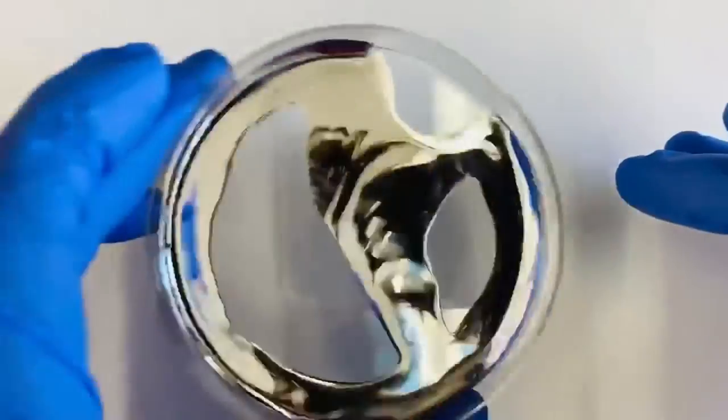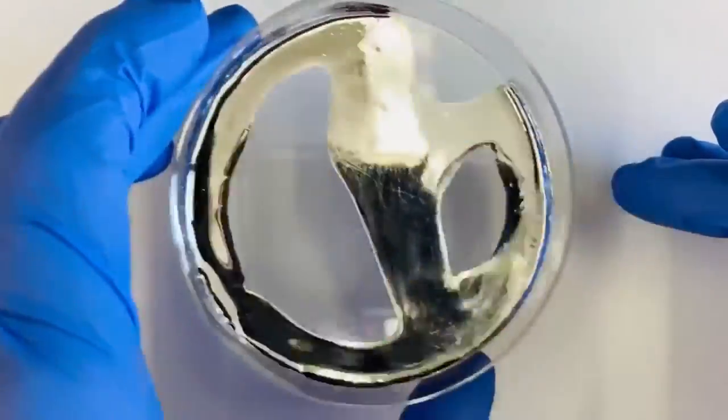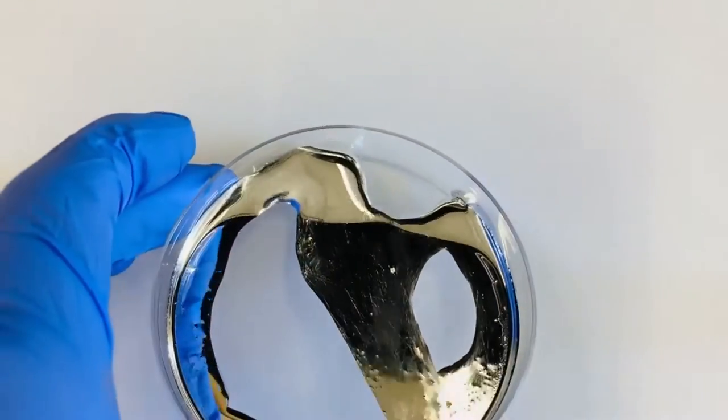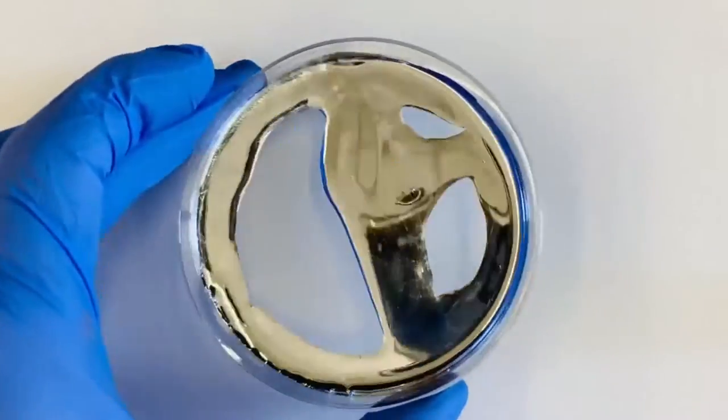As you can see here, gallinstan adheres to surfaces quite strongly. While this property does make it a bit difficult to use gallinstan, it did allow me to make a goofy-looking smiley face on this petri dish.